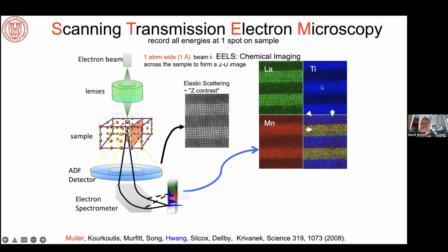There are monochromated systems where if you're running at 60 kilovolts, you can get down to 5 milli electron volts on the beam and still retain atomic resolution with a lot less current. But it is in fact possible. A nice way to think of this is it's like a little small linear accelerator, a small beam line. And by the time you've stuck things on the beam line, the costs are not quite the same, but as the machines get fancier, the costs are getting up there.